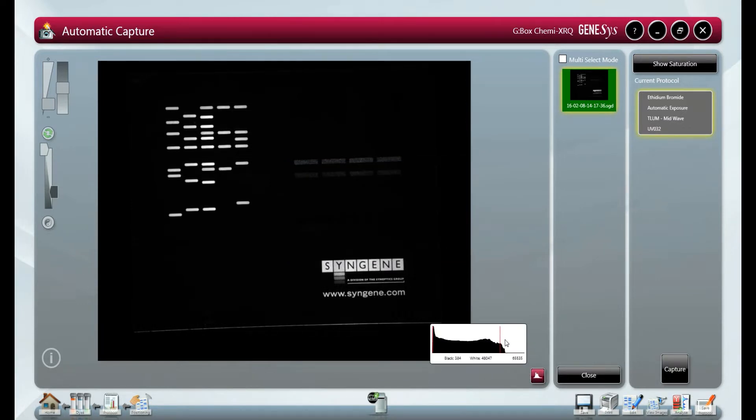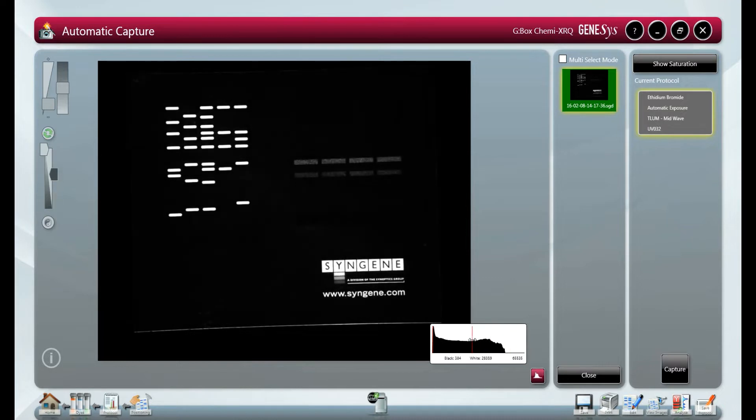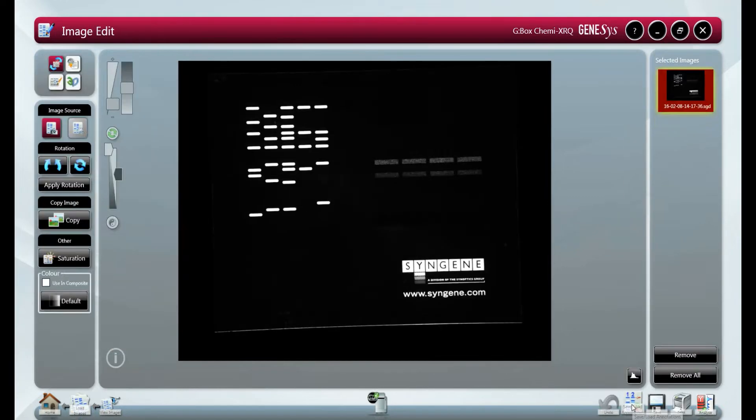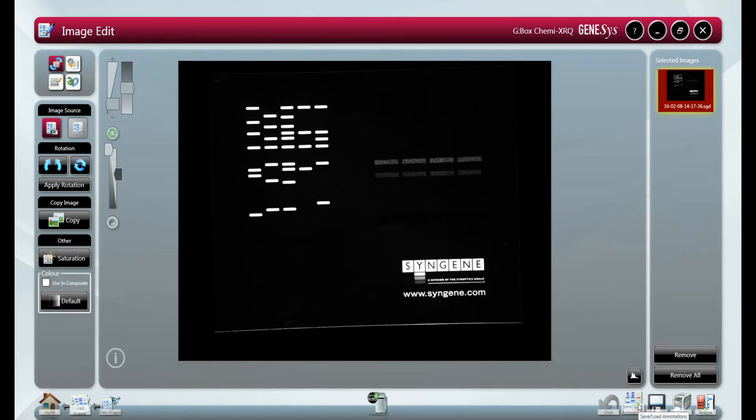We have the option to look at our histogram to maximize the 16-bit gray scales used. As with all images in Genesis these can be annotated or exported directly into gene tools for analysis and simple quantification.